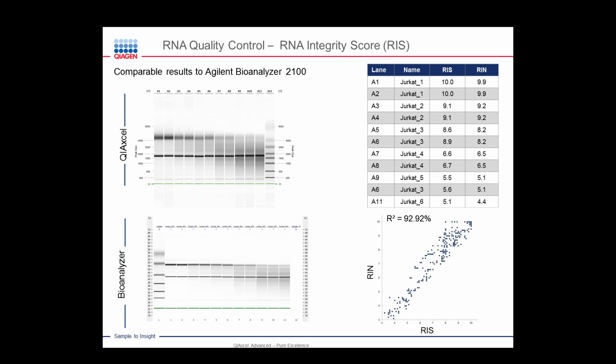The integrity values range from intact to degraded, and were analyzed on the QIAxcel Advanced, you can see this here in the gel-like image, and on the Agilent bioanalyzer.